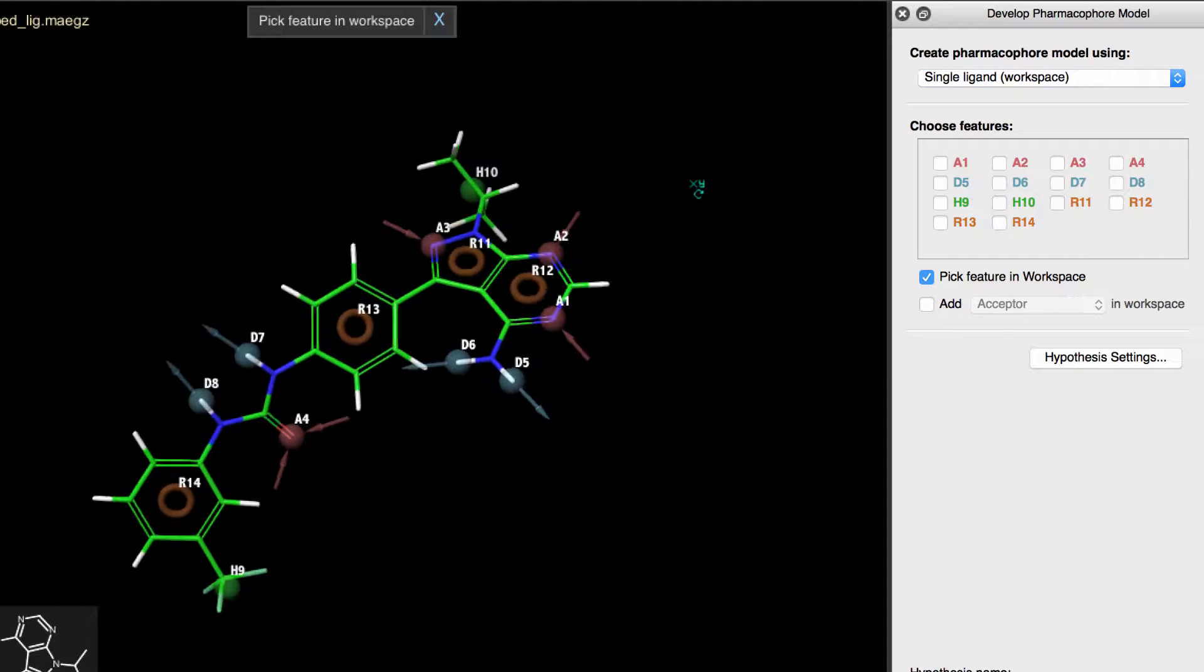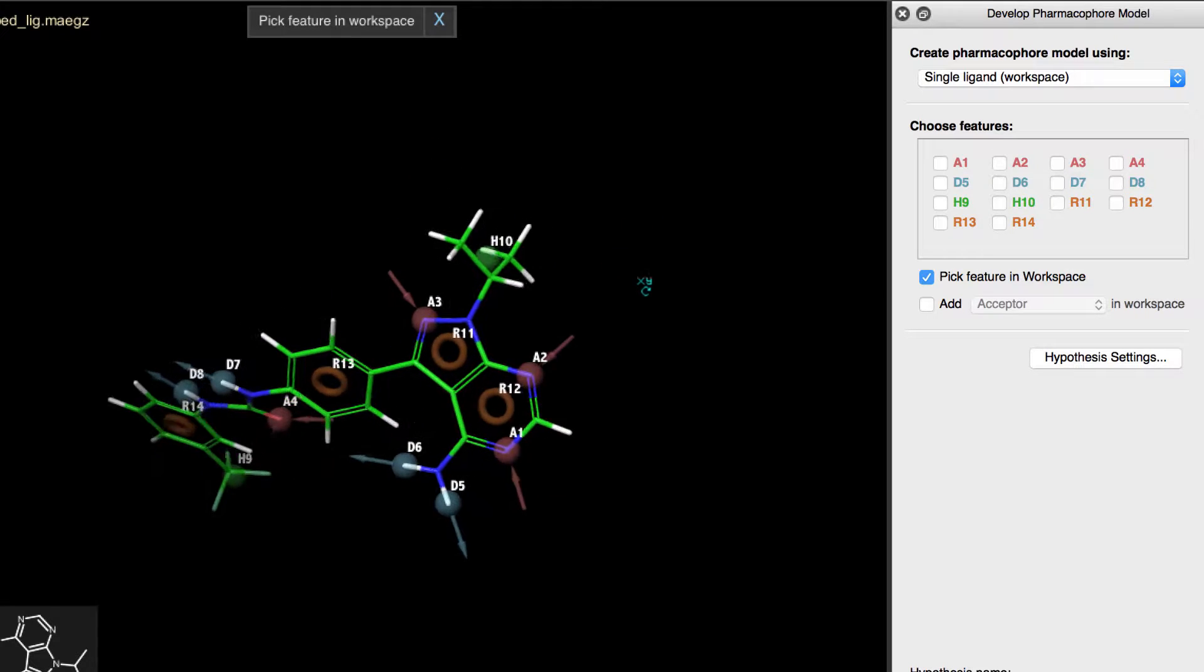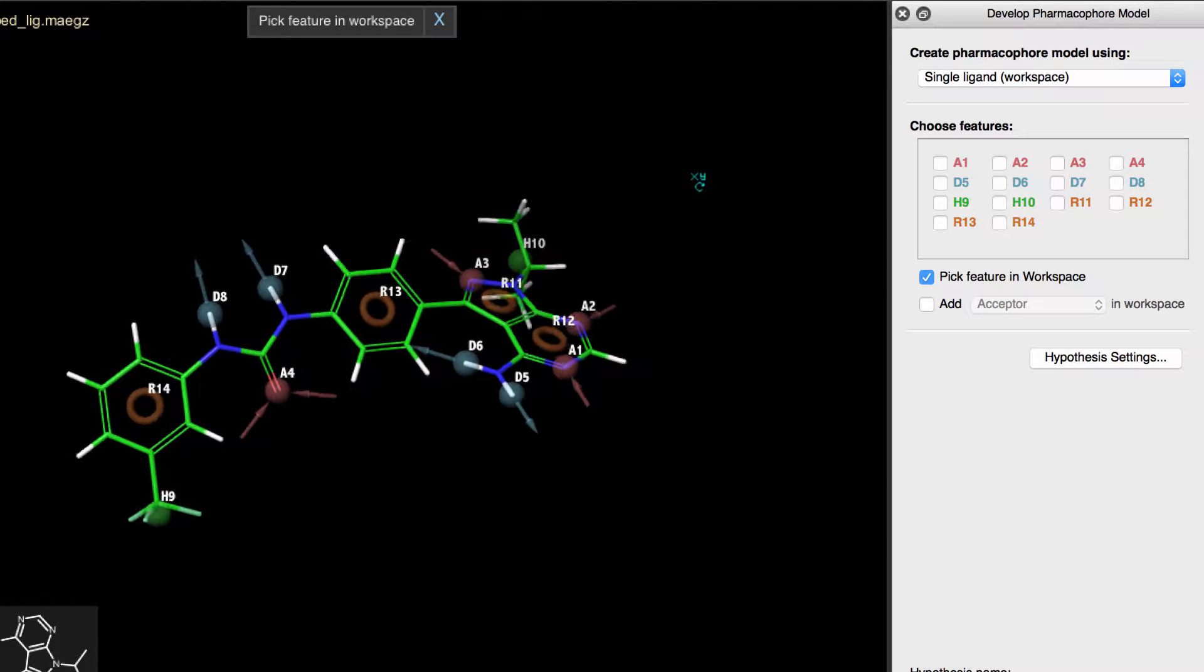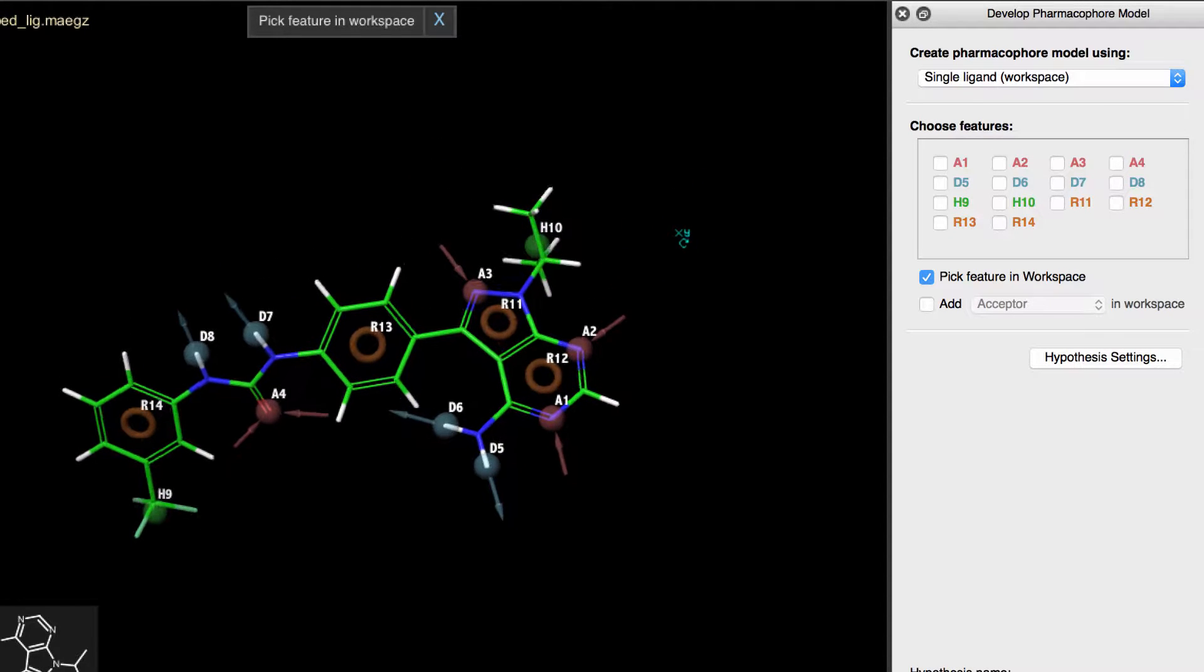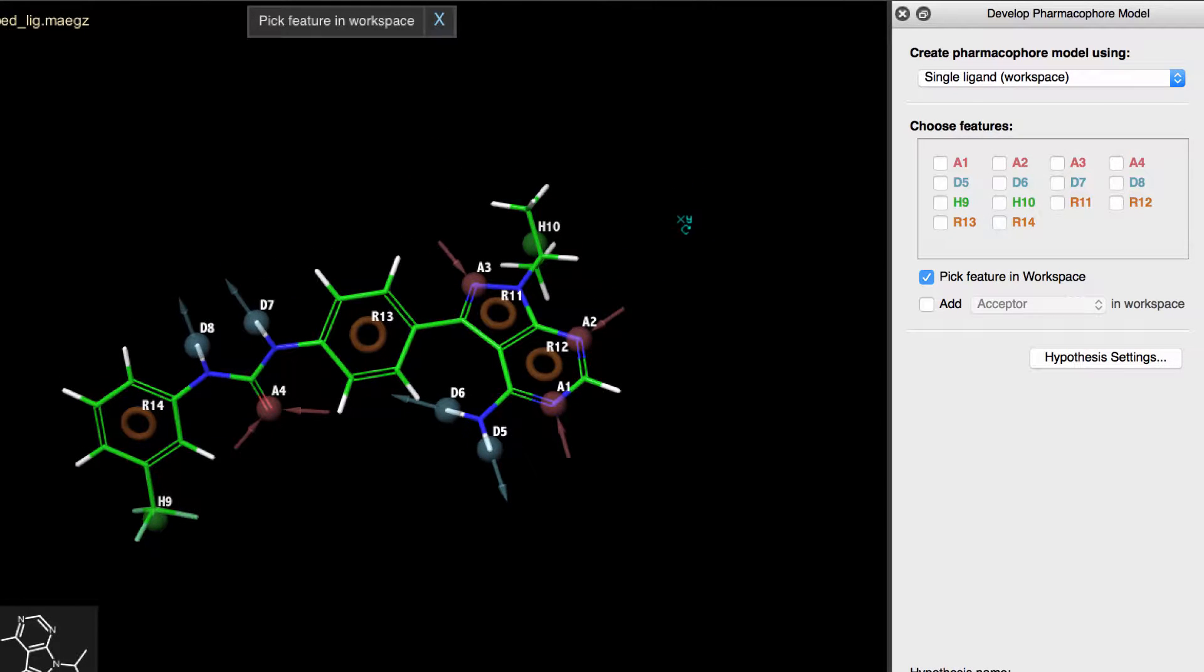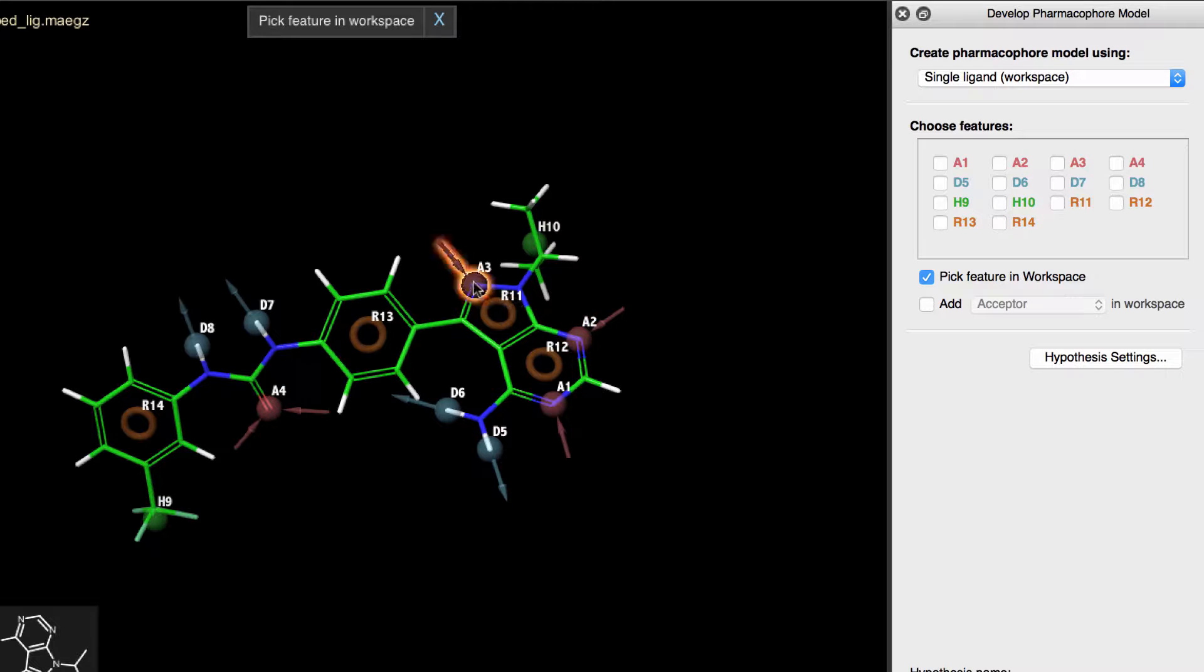Now here, all possible pharmacophore features are displayed on the 3D ligand, so all we have to do is simply choose which of the features we desire in the final hypothesis.